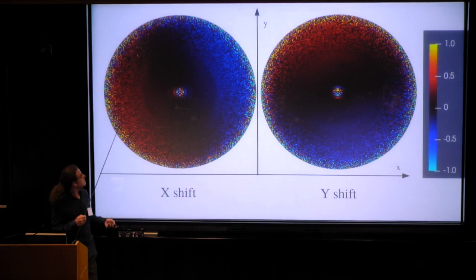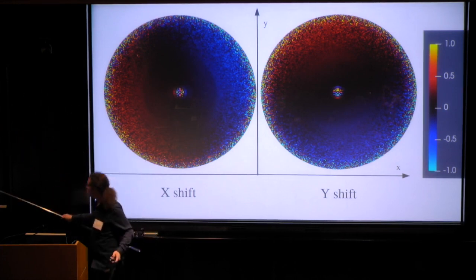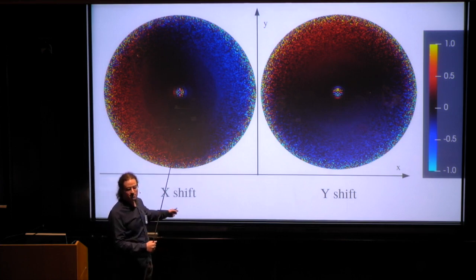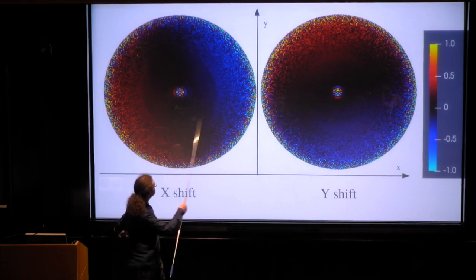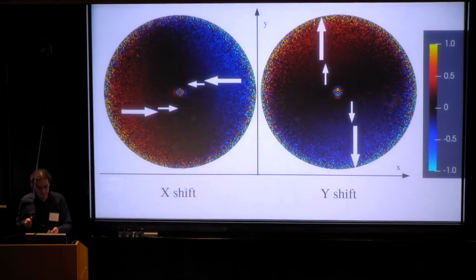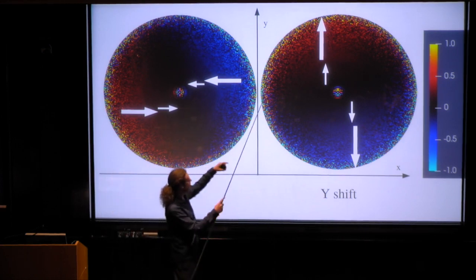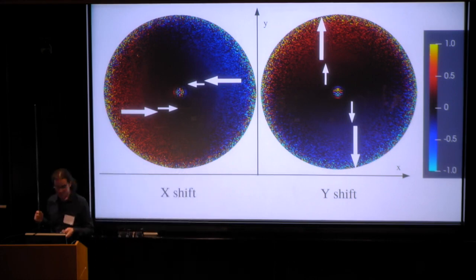And when we look at them, you can probably see it better over there. So here you see the 2 components of the per pixel displacement. And you see how they do line up along linear manifolds. And if you interpret that together with the coordinates, it means that the x coordinate is squished and the y direction is stretched, and at a slight angle.